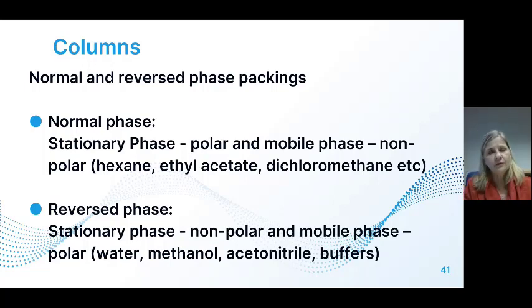We also have reverse phase chromatography, which is the one that we most often use because it's more versatile than the normal phase, and your separation is better on a reverse phase. Normal phase would have very strong attraction and adsorption, and you can have distorted peaks, while with reverse phase, because of the wide variety of mobile and stationary phases, we can get better separation.